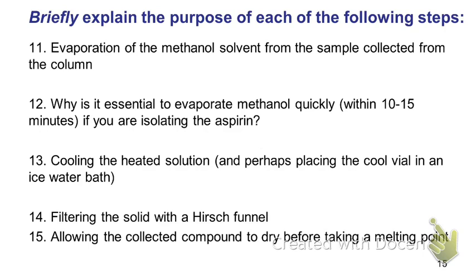But if we take a look at questions 12, 13, and 14. Question 12, why is it essential to evaporate methanol quickly if you are isolating the aspirin? Anybody know? I haven't said it yet. I will say it. You probably don't know because you know nothing about the chemistry of these molecules. What's happening? Methanol can react with the aspirin. I'll write up the reactions on the board so you can see what's going on with that. It's not explained in the lab manual. It's not explained in our slides.